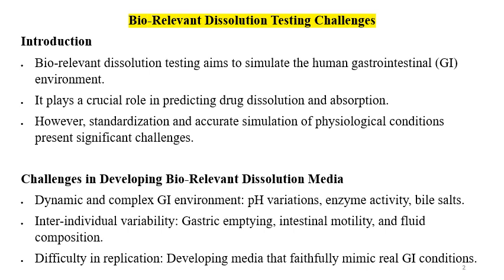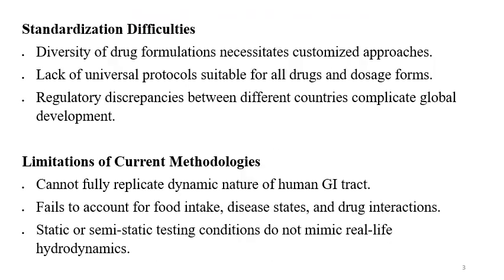Nowadays, ready-made media are also available which you can purchase, and you can prepare the biorelevant media, specific pH media, and perform the dissolution. But it is not always easy to exactly mimic the dissolution media which will reflect or simulate the GI environment.